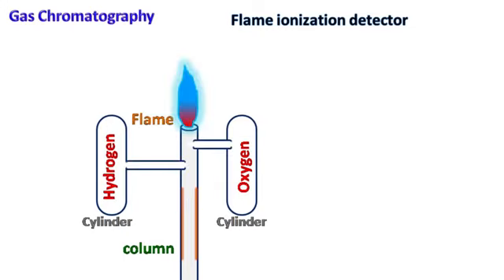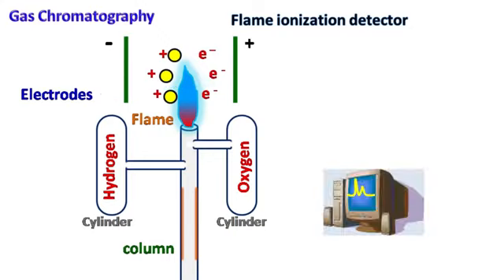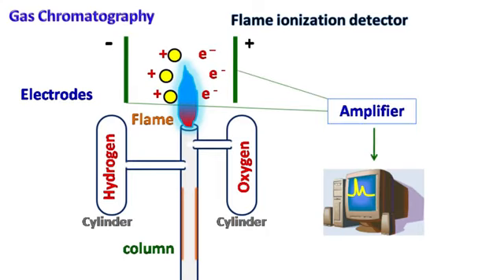The igniter ignites hydrogen and oxygen to produce a flame. When the sample molecules reach the flame, they get ionized and electrons are released. Across the flame, there are 2 electrodes, one positively and one negatively charged. The electrodes detect the electrons generated by the ionization of the sample. The electrons are detected in the form of current, which is amplified and detected by the computer.